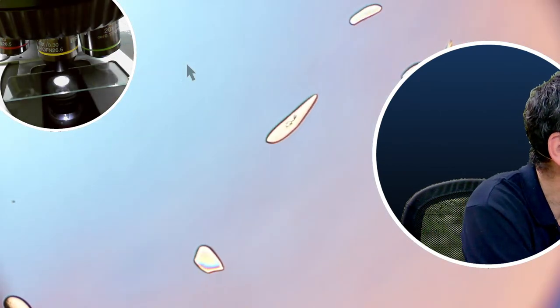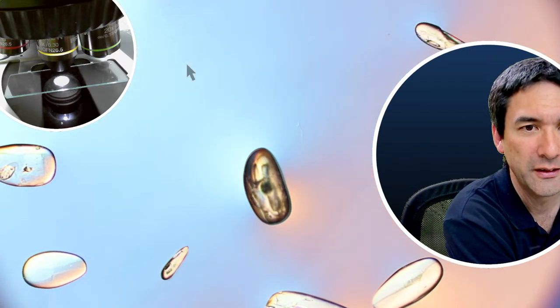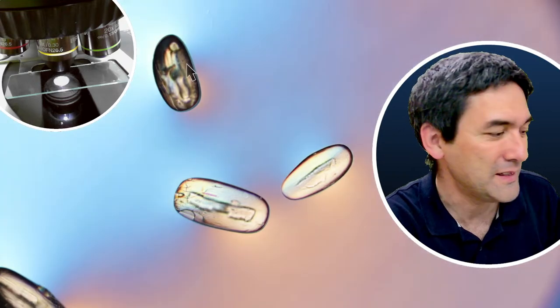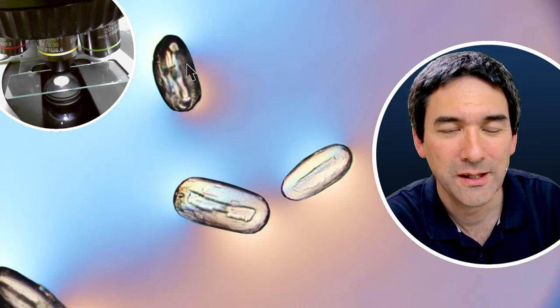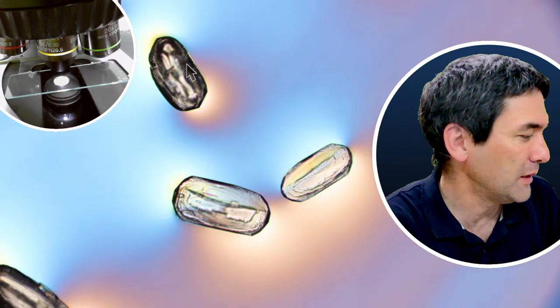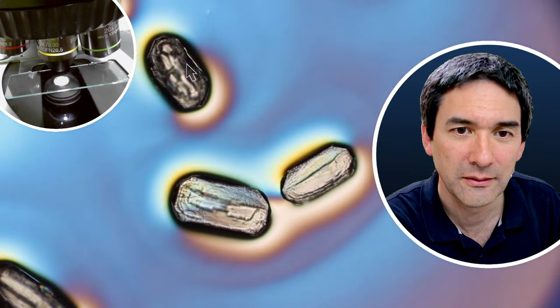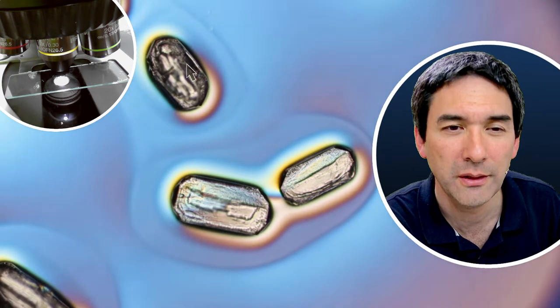Again, we have to be a little bit patient here. Look, these are crystals which are just dissolving. That's why they're so round. Looks nice. Okay, that's aspirin in alcohol. So they kind of lose their sharp edges as they dissolve, and this is now in polarized light in DIC without cover glass. And let's see if it starts to form. You see actually some of the alcohol disappearing.